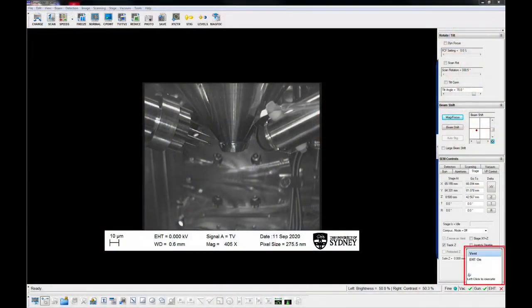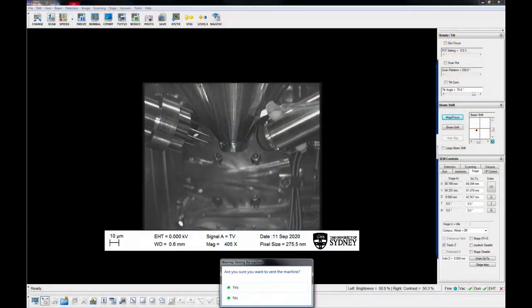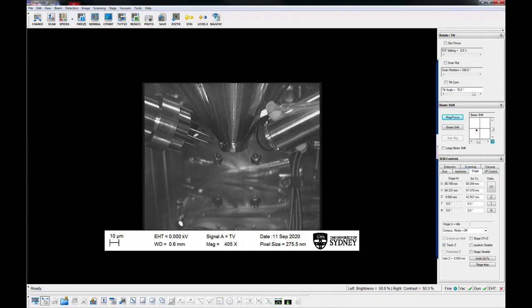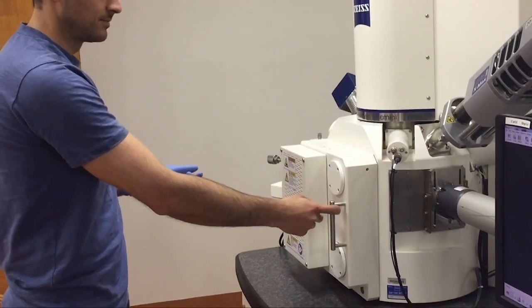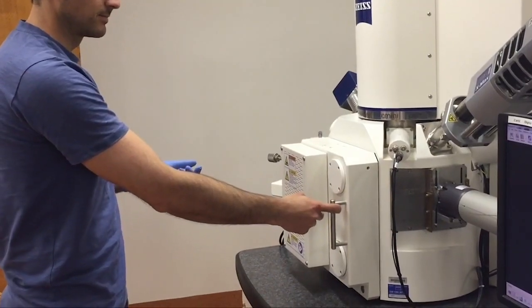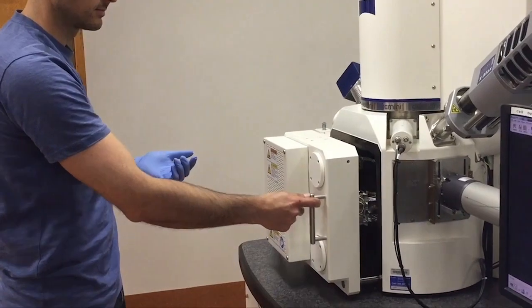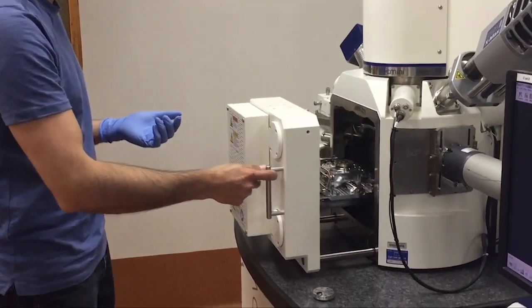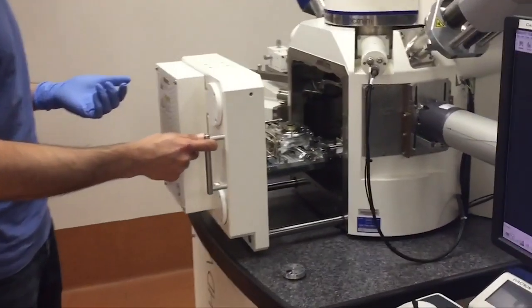Vent the chamber by clicking on back and selecting vent. This will take around three to five minutes. Once the chamber has vented, carefully open the chamber door with your ungloved hand.